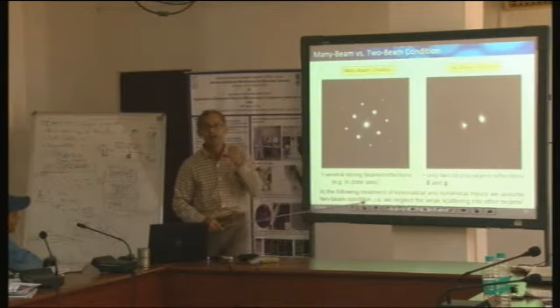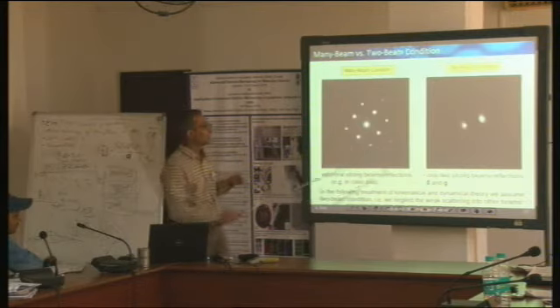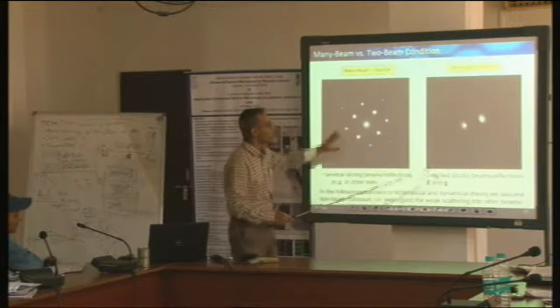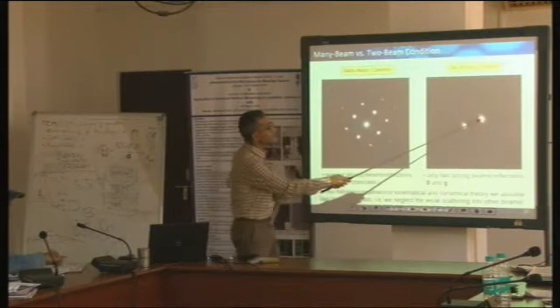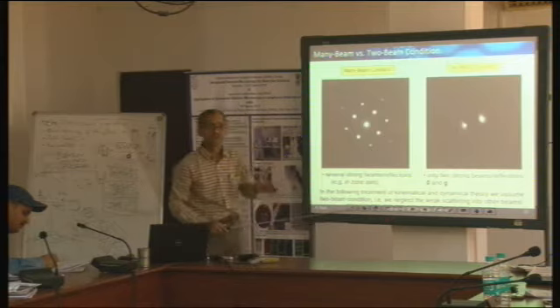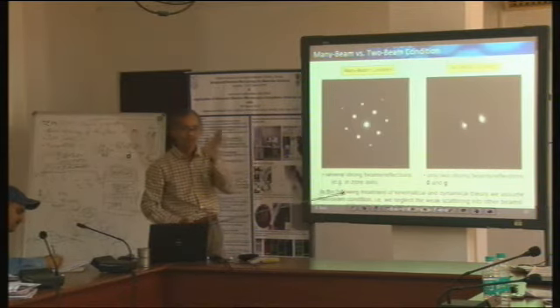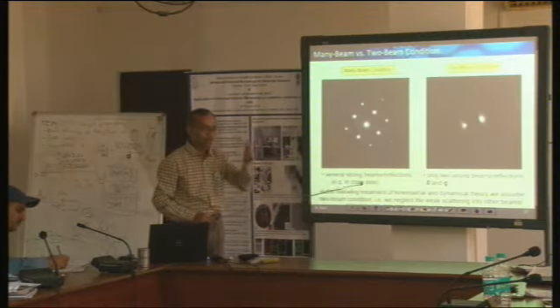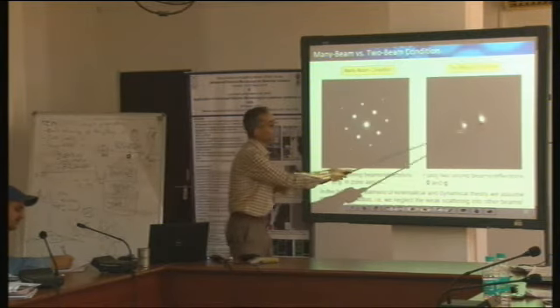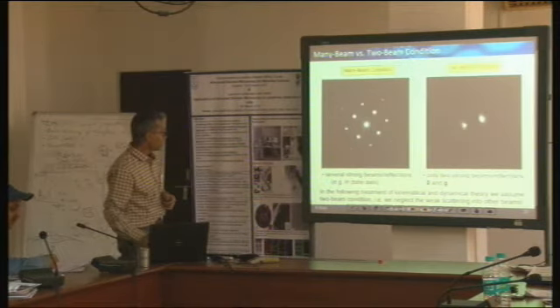We always try, unless it is otherwise necessary, to acquire images under two-beam conditions, because here, assuming that this is the zeroth reflection, only this particular reflection is strongly excited and all others can be neglected more or less. That allows me to interpret all my contrast in terms of only these particular lattice planes corresponding to that G reflection.